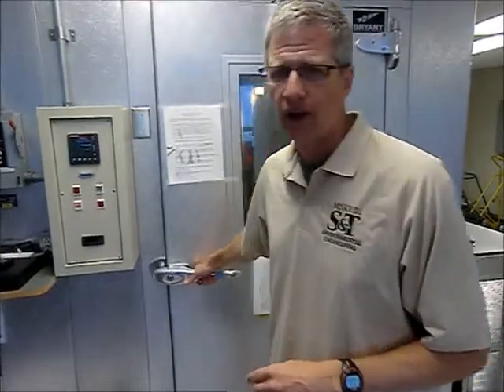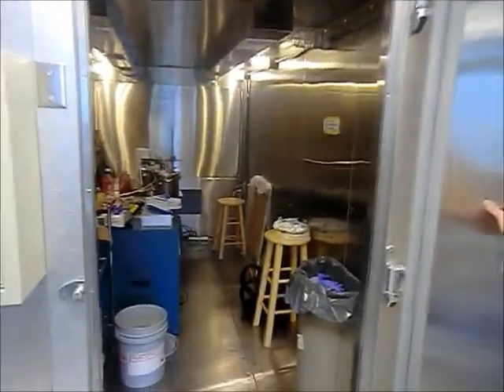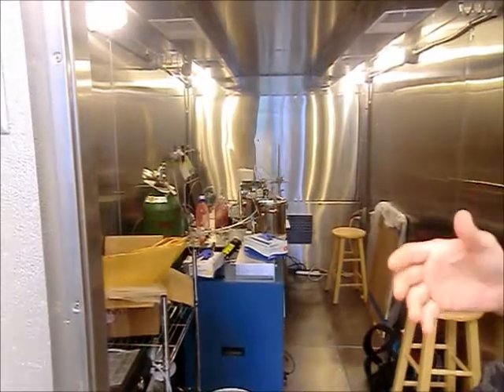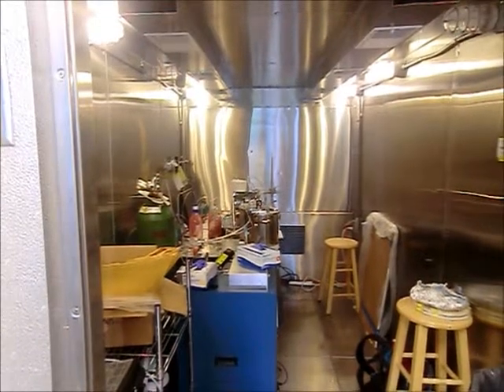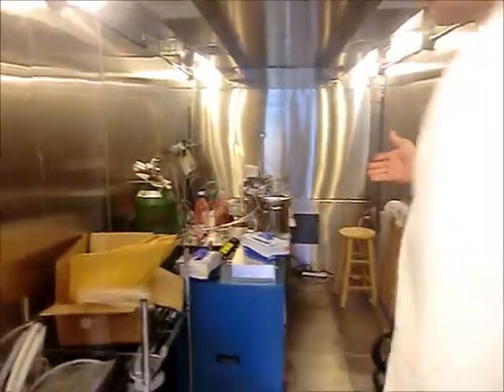Let's take a look inside. Inside are a variety of things, including several chambers and some samples, and it's, as usual, a little bit untidy, but that's normal for these systems. Let's go in a little bit closer here.